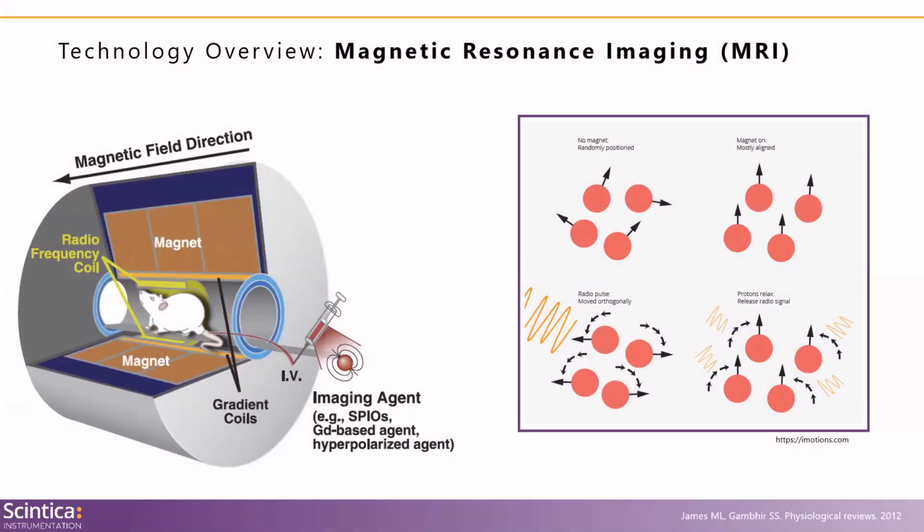While all MRI systems can be a little different, in general, an MRI scanner is comprised of a set of embedded coils. We have one coil that generates the main magnetic field, which we see here in orange. We have gradient coils that are used to localize the source of the MR signal. And finally, we have RF coils, shown here in yellow, which excite the sample and detect the resulting MR signal. The magnetic field from the MRI will interact with certain atomic nuclei, either in the body or elsewhere, that have special spin characteristics and magnetic properties.